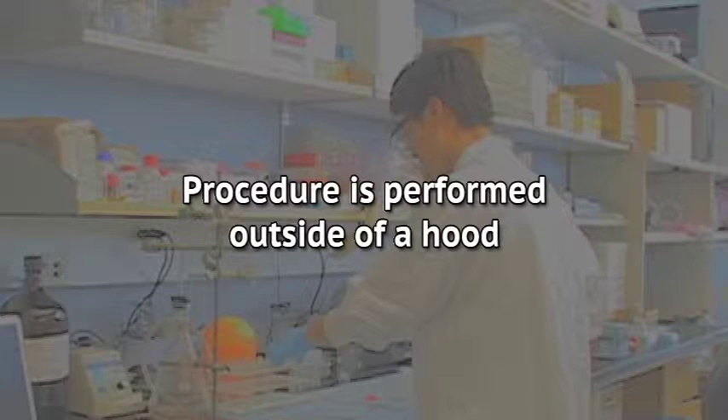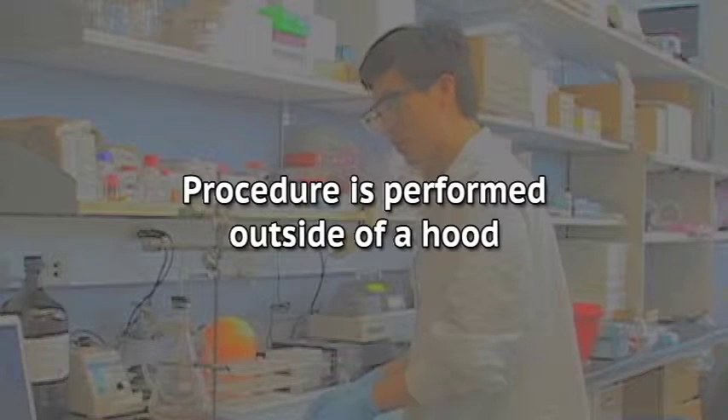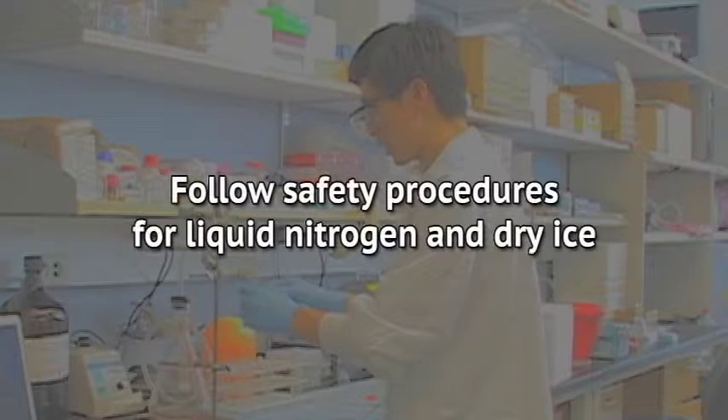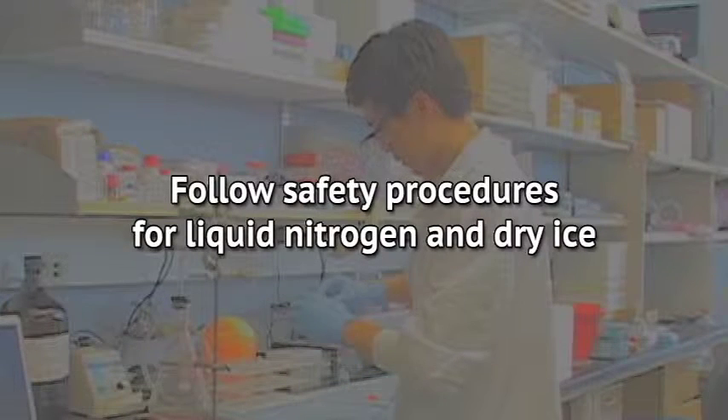These steps are best carried out outside of a cell hood, as the short duration of the procedure ensures that contamination from the non-sterile environment will not significantly affect the cell metabolome. As this procedure uses liquid nitrogen and dry ice, all proper safety precautions should be taken when performing these steps.